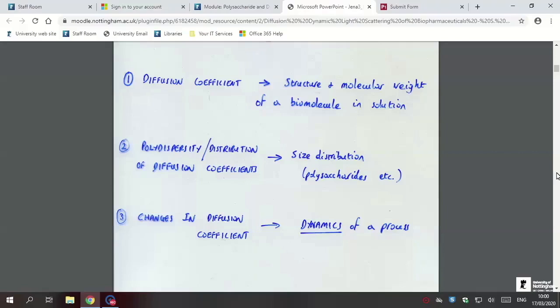In the lecture you had, was it Jan gave a lecture or Dave Scott, on crystallization of proteins? Dave. I'm sure Dave would have mentioned the fact that it's not easy getting proteins to crystallize. And some very interesting ones just won't crystallize. They're called stubborn non-crystallizers. And with dynamic light scattering, there's a way of seeing if these methods can cause nucleation and growth of crystals. So the dynamic light scattering instrument is very, very useful.